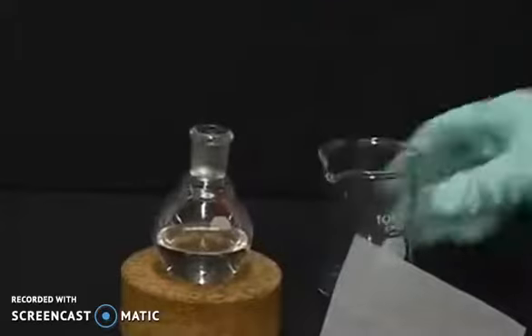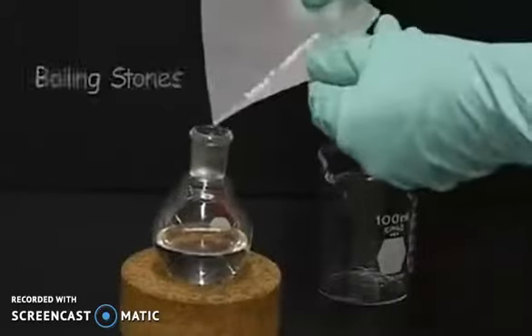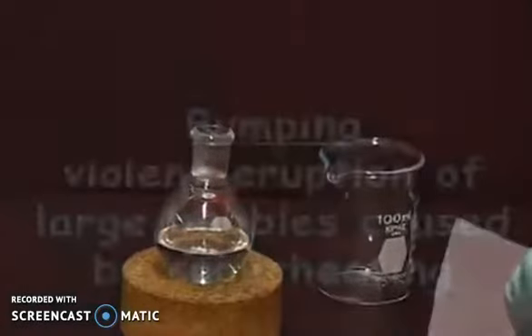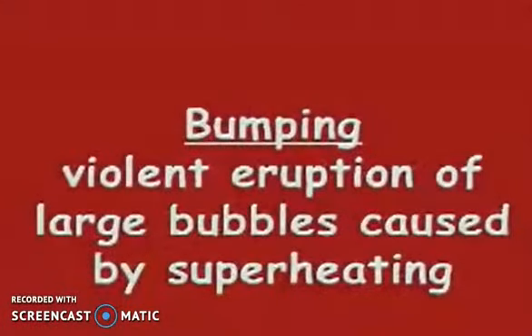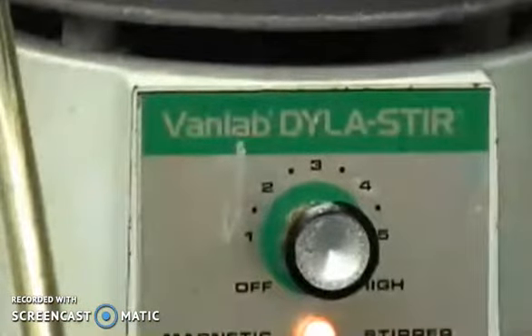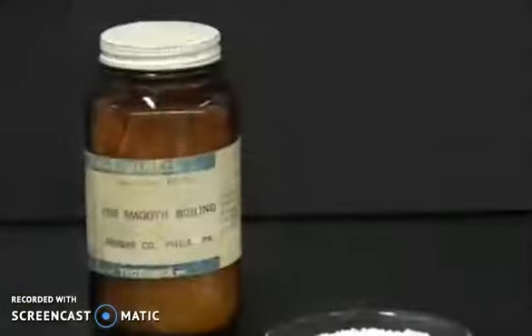The round bottom flask should not be more than half full. Add boiling stones to the solution to avoid bumping—violent eruptions of large bubbles caused by superheating. This results in material loss. Magnetic stirring also allows bumping prevention because the solution is disturbed, breaking up large bubbles.